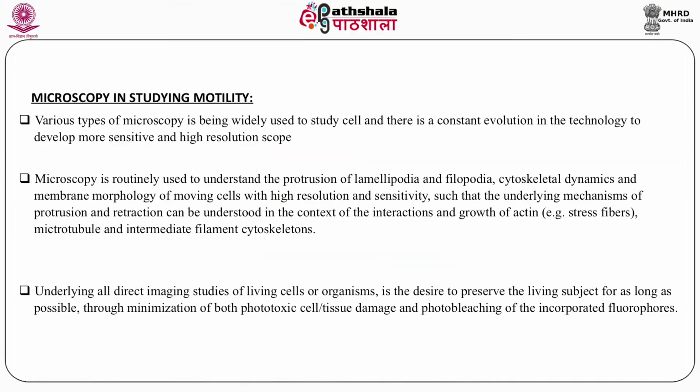Underlying all direct imaging studies of living cells or organisms is the desire to preserve the living object for as long as possible by minimizing both phototoxic cell or tissue damage and photobleaching of the incorporated fluorophores.